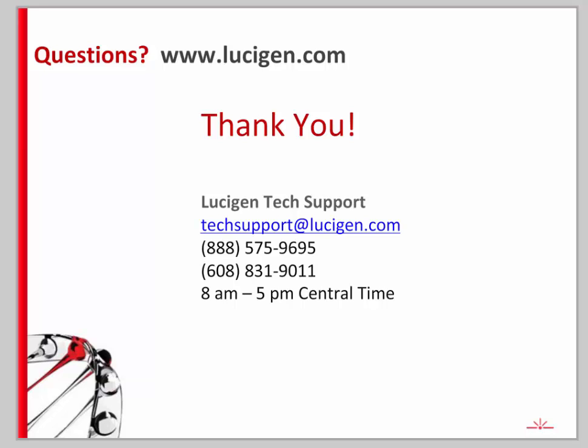Looks like we do have a couple of questions coming in. The webinar will be posted on the same page of our website that the existing webinars Eric mentioned are posted on. First question: how do you make custom competent cells for non-E. coli bacteria? I can speak a little to this. We do have some requirements about the custom competent cells that we make. They must be BSL-1 organisms. We do not handle BSL-2 organisms in our production facility. Other than that, we can do custom quotes for a lot of different projects. So if you just want to contact us and give us details of your project, we can send you some information.